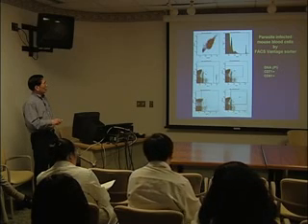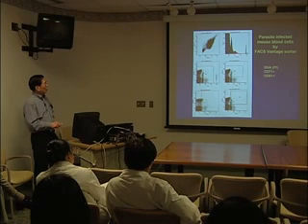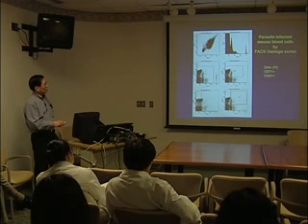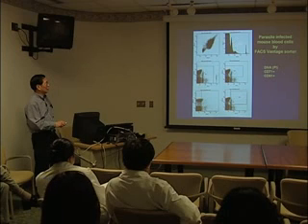So in here, again, you look for the single cells, and if you only look at the DNA content, you have several peaks. That's your immature human red blood cells with a large amount of DNA content. I'm sorry, this is not human, this is mouse again, but we use it as a calibration for the instrument. This is the DNA content of a malaria parasite.